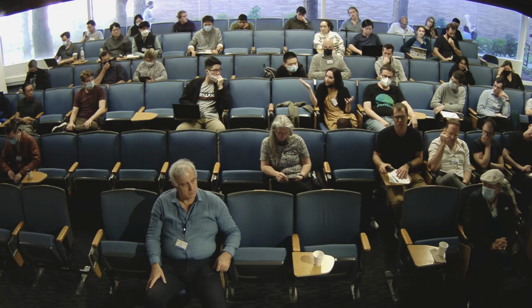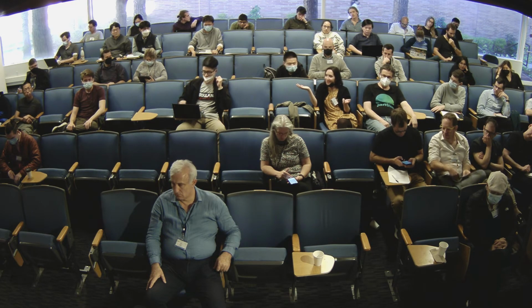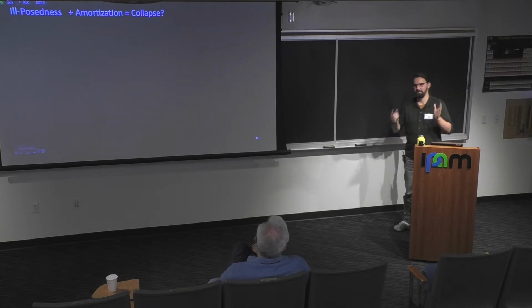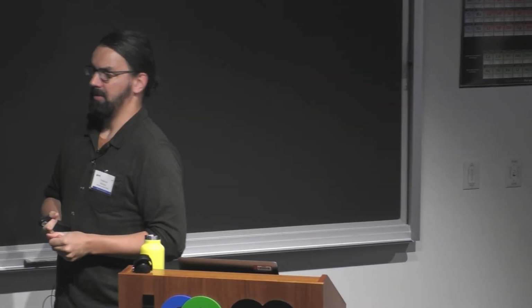Yes? So isn't this a problem that all reconstruction algorithms face? Yes. And why do they work? The short answer is because they don't amortize and because they do systematic pose search, which means that if you systematically go across SO(3) and you don't just flow there, you might be able to jump to the right solution at some point. In principle, yeah. But if you look at the CryoSPARC process, for example, or maybe RELION, early on you'll often end up with something symmetric, and then you will escape from it because of this pose-search mechanism. When you encode, when you amortize, and that's a problem that we encountered, you don't have this escape mechanism built in, and that's why we are building it. That's exactly what's going on, yeah.